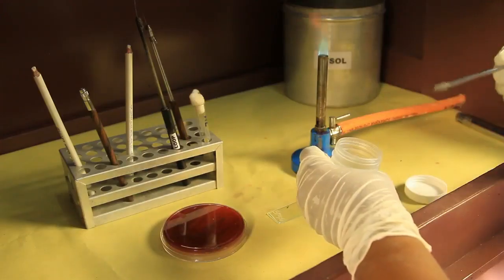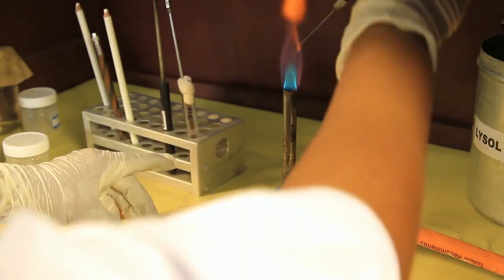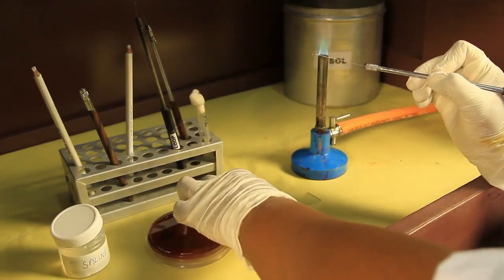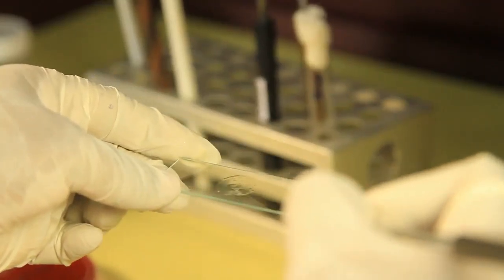Smear preparation from solid culture media. Take a loopful of normal saline and smear it onto the middle of a glass slide. With a sterile inoculating loop, pick a colony from the culture plate and emulsify it into the saline while spreading the smear. Let the smear air dry.